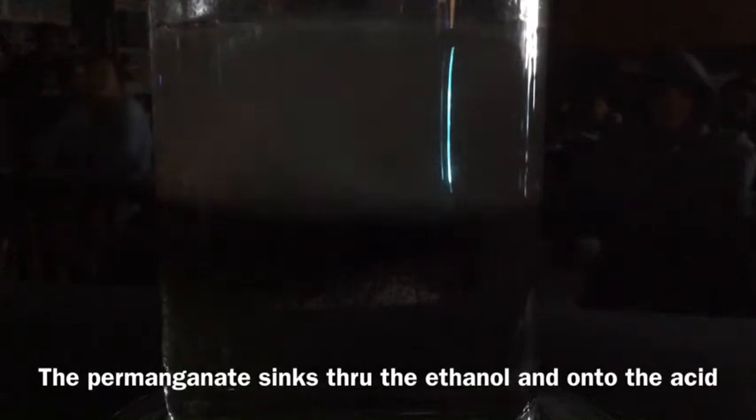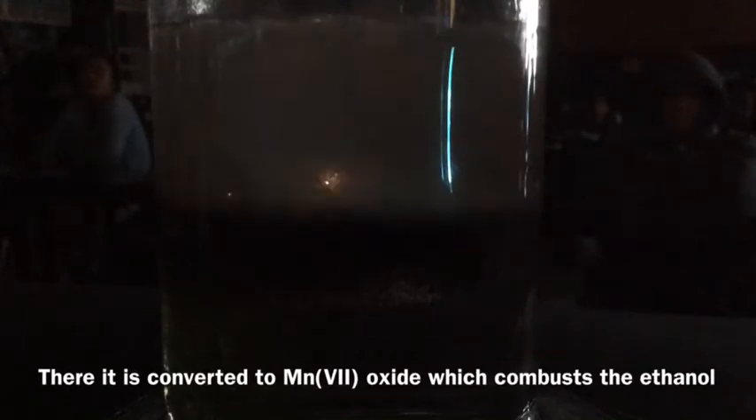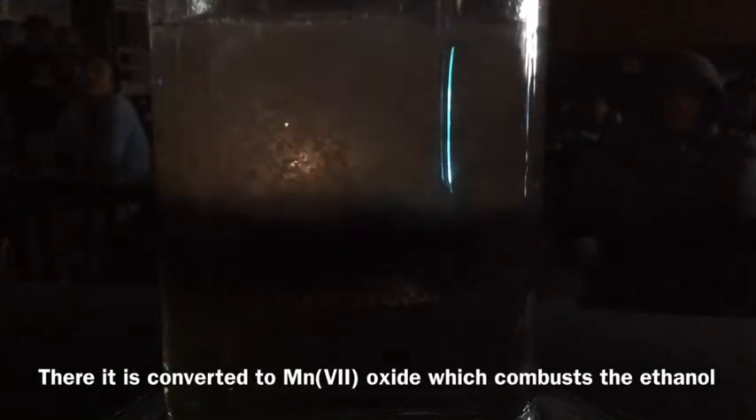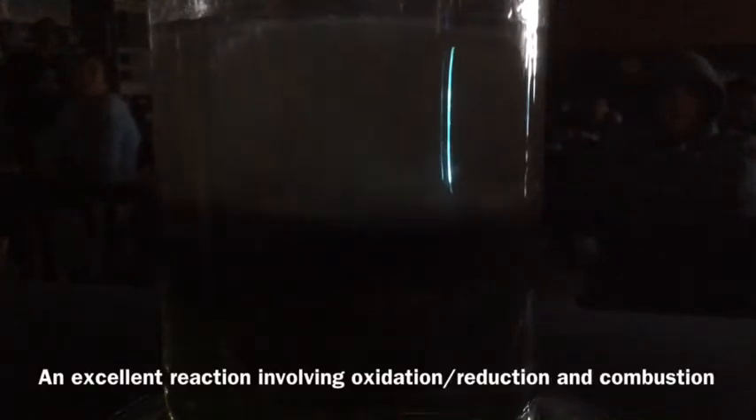Every time a small kernel of that potassium permanganate gets converted to manganese oxide, it's an exothermic process. And between that and the fact that it's an oxidizer, it has spontaneously combusted in a small amount of ethanol there. Of course, there's no oxygen down there except what's being produced, which is why it's flashing and not just erupting in a big flame.